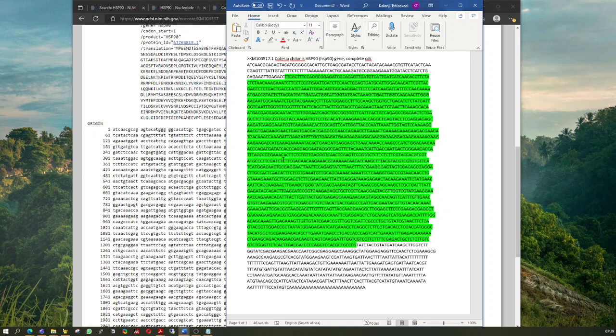So to make up for that and ensure that you actually have a very good amplification, you want to give your primers sequences that are a little bit outside of this region. I'm not going to go through this video, but be aware of the criteria selection for your primers.